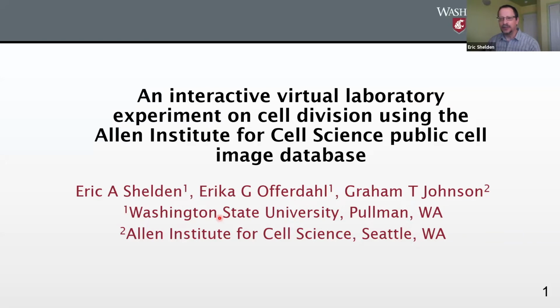What I wanted to do was to develop an exercise that was reminiscent of an undergraduate biology lab classroom activity that used this resource and also gave some insight into real science. And this is what we came up with, which is the virtual lab on cell division.